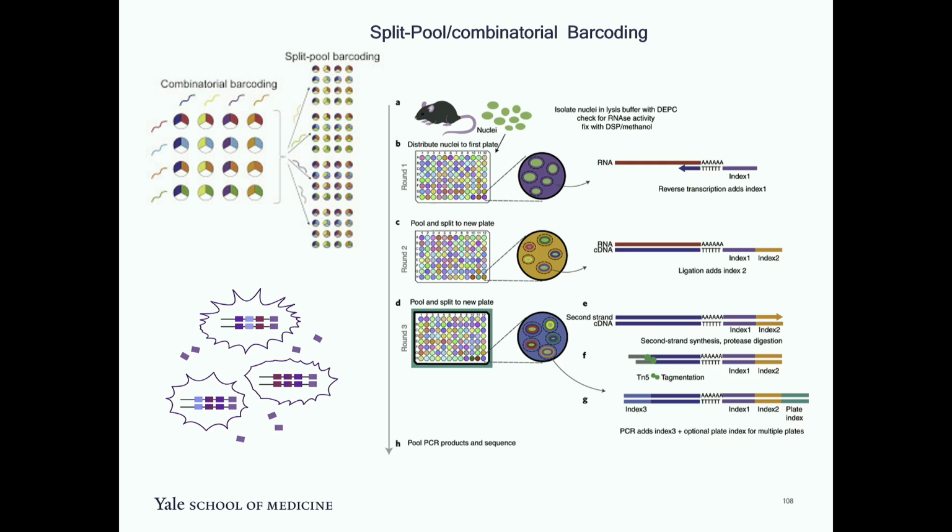So if you want to capture 10,000 cells, you cannot start with 10,000 cells. You need more than that. Like PIP-seq, you need at least 2 times more. If you want to capture 10,000 cells, your input cell number will be 20,000 cells. The term used here is capture efficiency, and for 10x it is around 65%. But for others like Parse and Fluent, it is around 50%. So based on capture efficiency, you need to extrapolate.